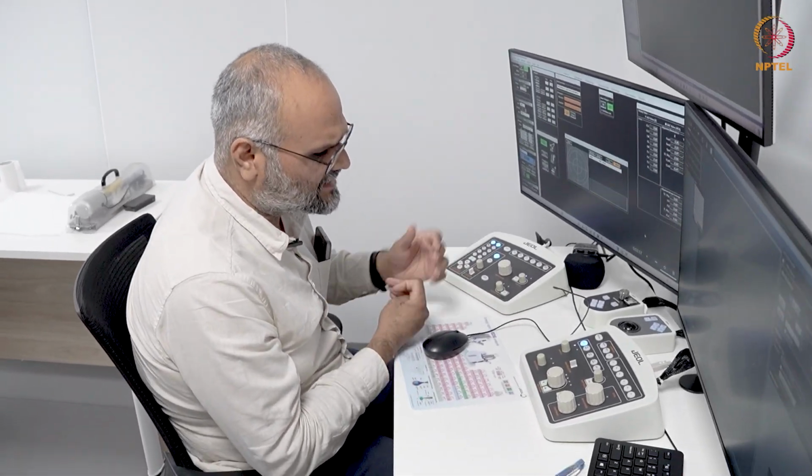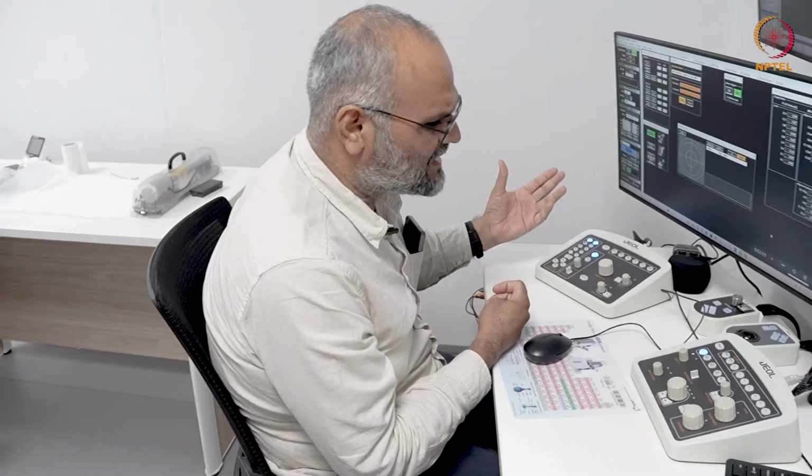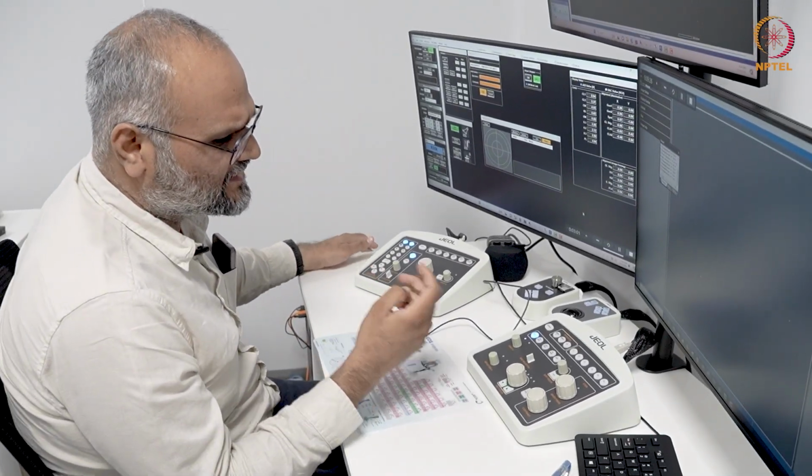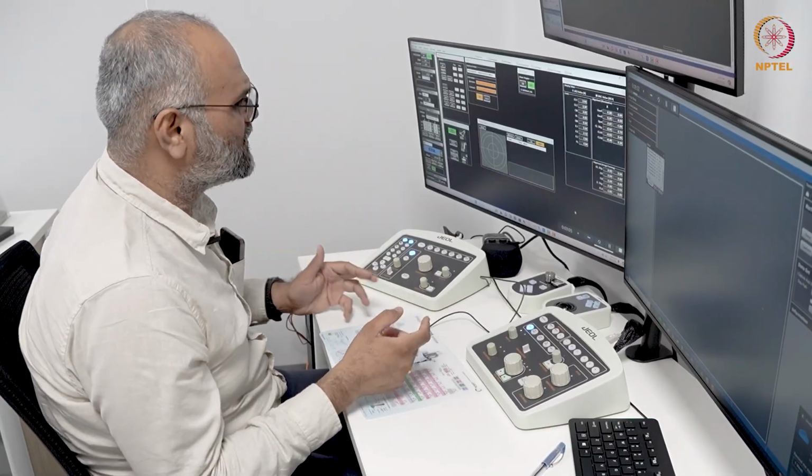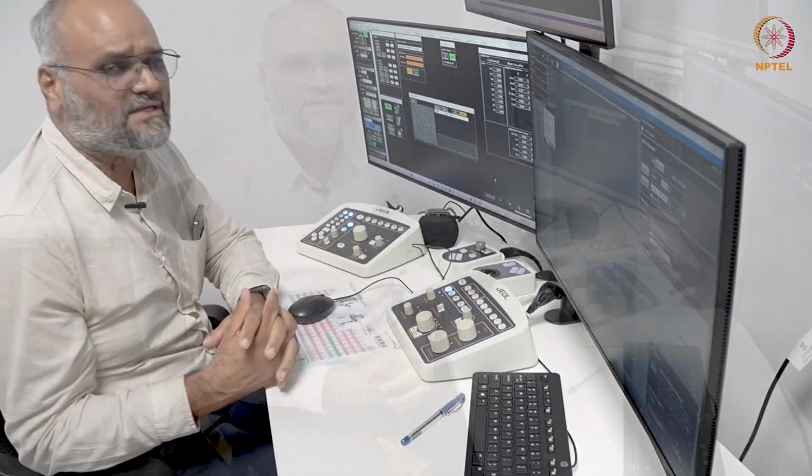recording on the software, and we'll go through the software layout as well once, and we will see how to operate this instrument after loading the holder. So now we'll move on to load the specimen holder. The sample we are going to study today is actually a standard gold cross-grating specimen. I'll only show you some basic imaging modes and basic correction operations with the Corrector software.